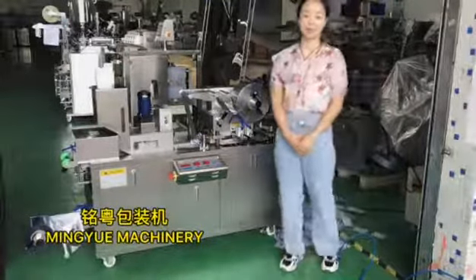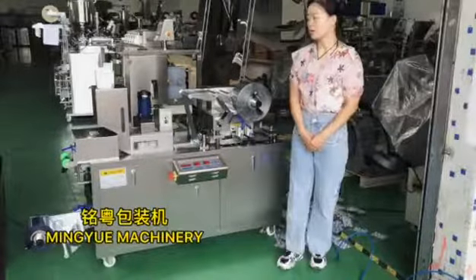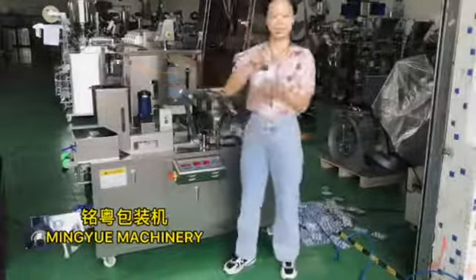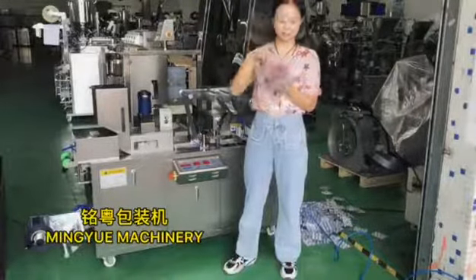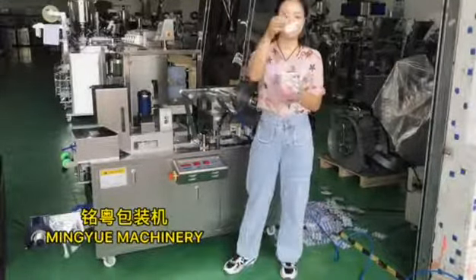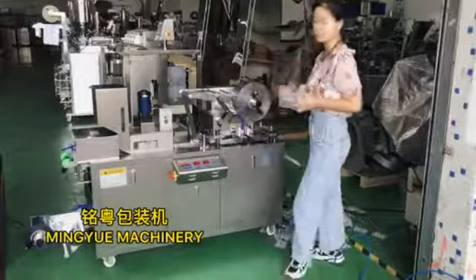This machine is suitable for packing a type of capsule or candy in the release bag. This one for candy, and this one for capsule. Also, we have another type for packing liquid, but it is not this machine, it is another machine.